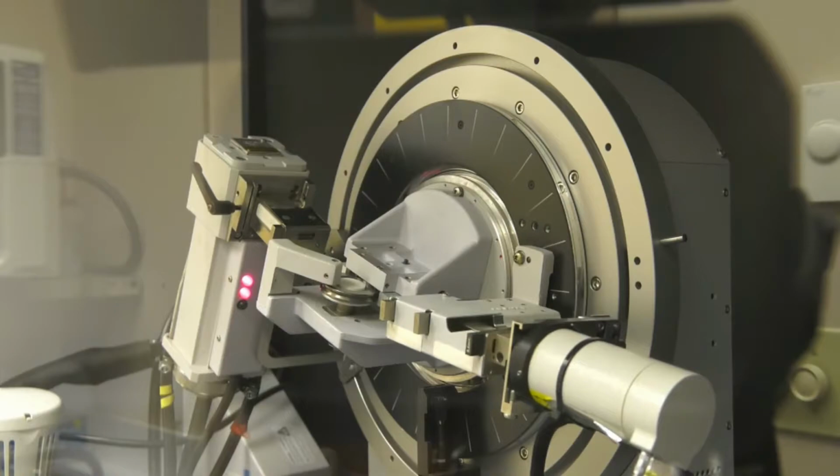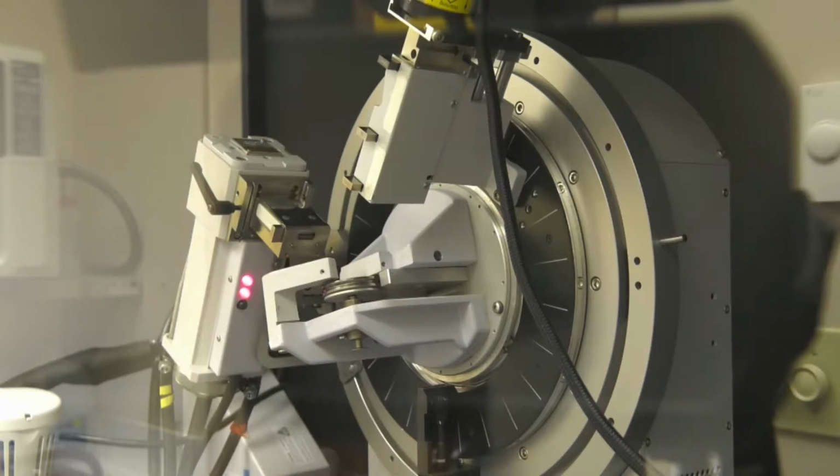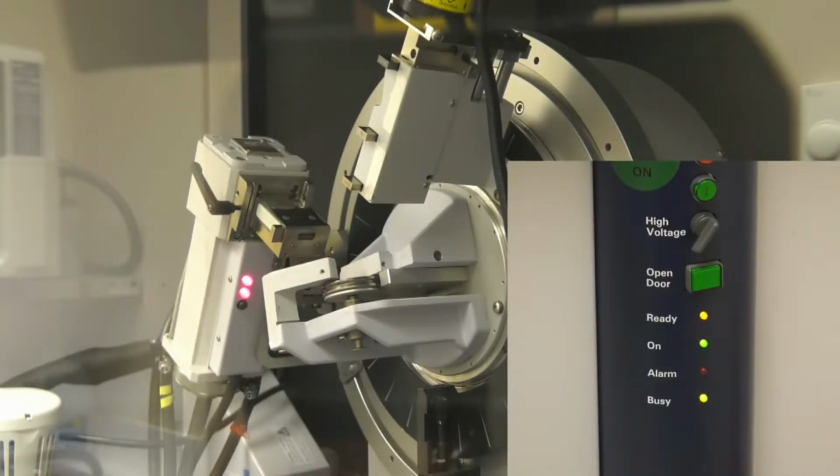This goniometer has a stationary X-ray source with moving sample stage and detector, but other XRD instruments may have a stationary sample stage with moving X-ray source and detector. During a scan, the busy light will be illuminated. When the scan has completed, the X-ray generator shutter will automatically close and the busy light will turn off. Now the sample is ready to be removed.